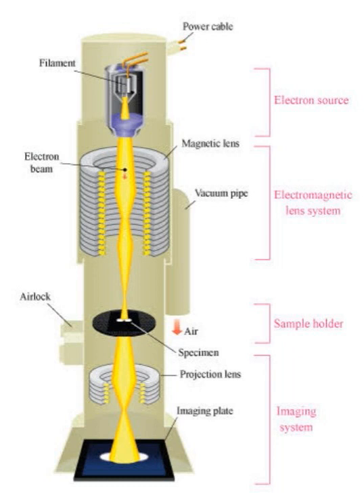The final image is observed on a fluorescent screen situated at the lower end of the stack and viewed through a glass window. The screen can be withdrawn by a lever to allow electrons to impinge on a photographic plate or film held in a camera. Given the high resolving power of the electron microscope, it is possible to enlarge the negative to very high magnifications.